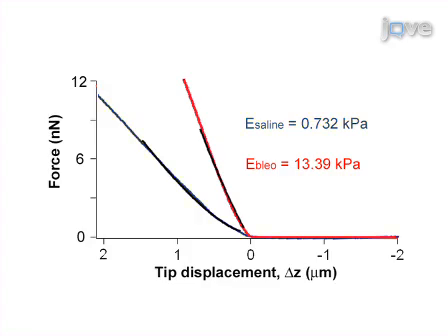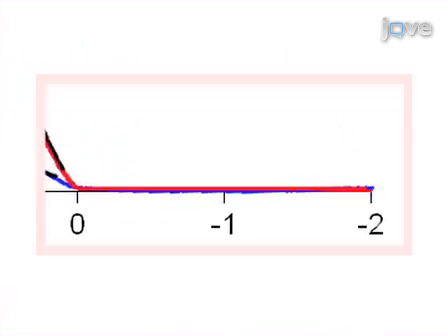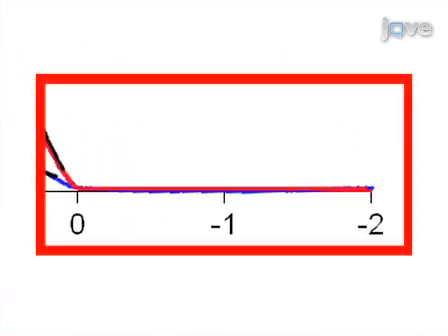In order to obtain clean force curves, after each indentation, the AFM tip needs to be retracted completely from the sample surface and free of contact before the next indentation. This contact-free state corresponds to the flat region of the curve, where the tip translates without cantilever deflection.